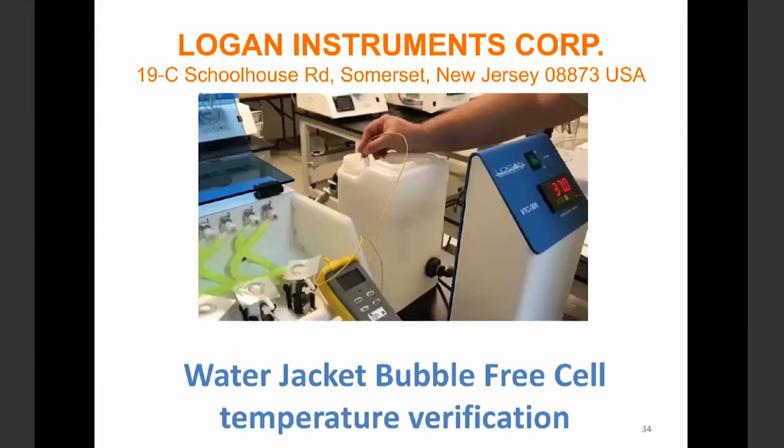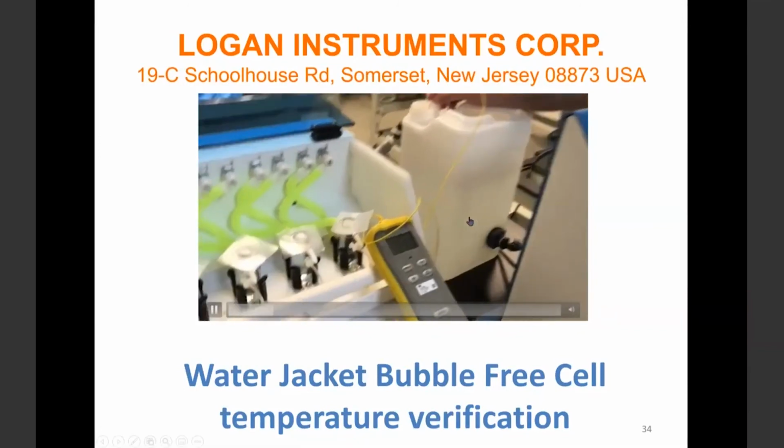So for the temperature, we have a validation. So what we do is, here is the water tank. The water actually goes into the heater circulator, then pumps into the cell water jacket. So what we do is we verify the temperature. We make the cell temperature the same as the water tank temperature.